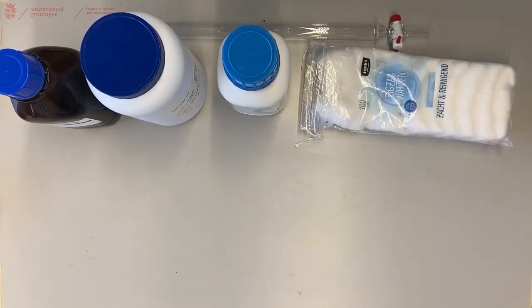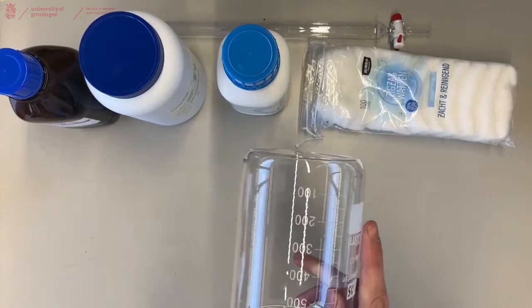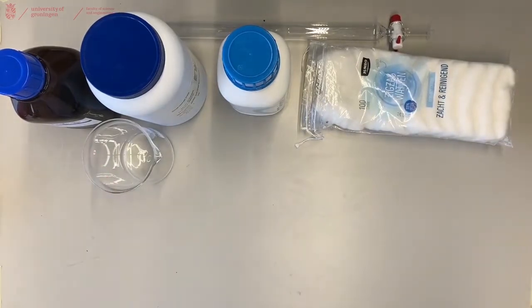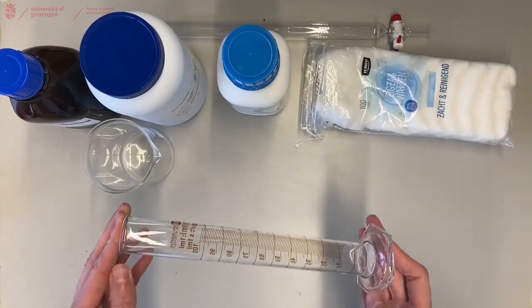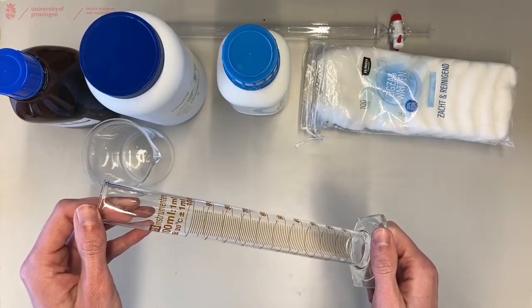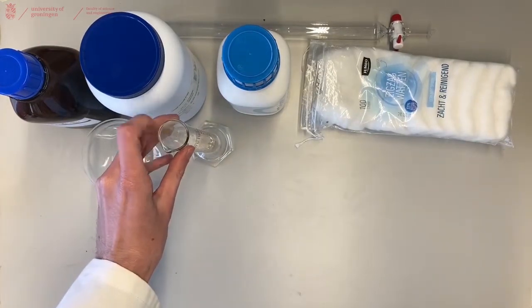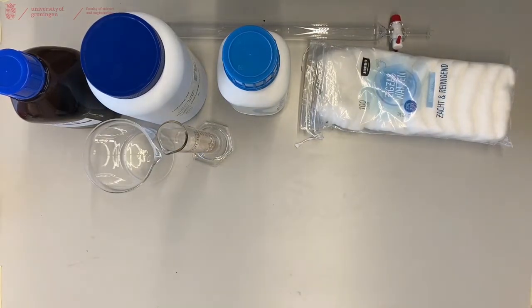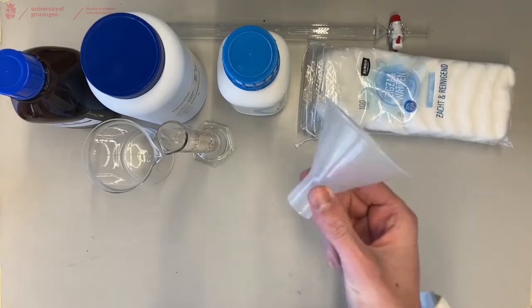You will need to mix your silica and your solvent, and for that it's handy to use a big beaker. And to accurately determine the mixture of your solvents, you can use a measuring cylinder. To add solids to the column, it's handy to have a big funnel.